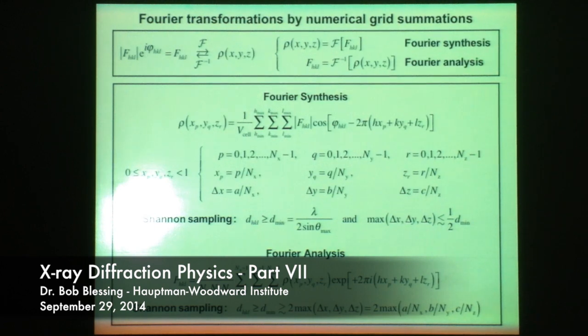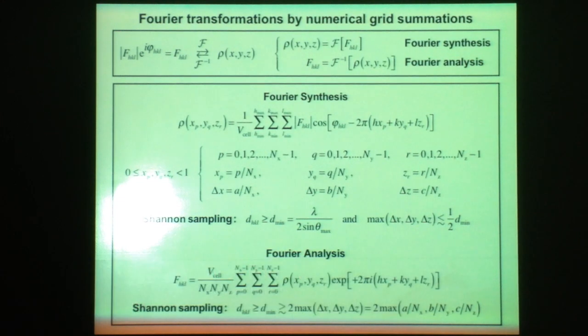So the way the computer does things for us is actually do a three-dimensional summation. We've got a set of structure factors, amplitude and phases. Maybe they're only approximate, but we assume at this point that we have such a thing. Amplitudes from a set of measurements, phases from some at least approximately correct model. So the computer then does the three-dimensional summation over this set of structure factors, each one multiplied by the appropriate transform kernel. And so we have P, Q, and R just indexing the points on this three-dimensional grid.